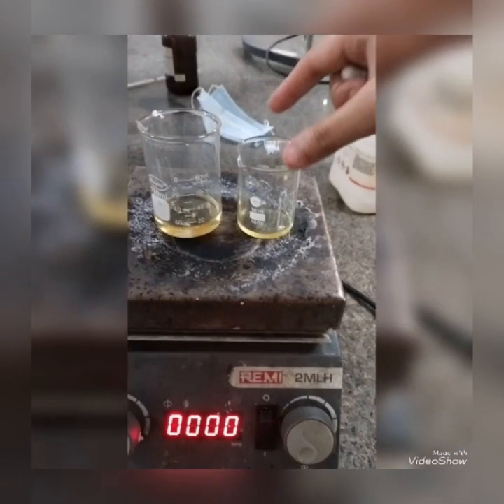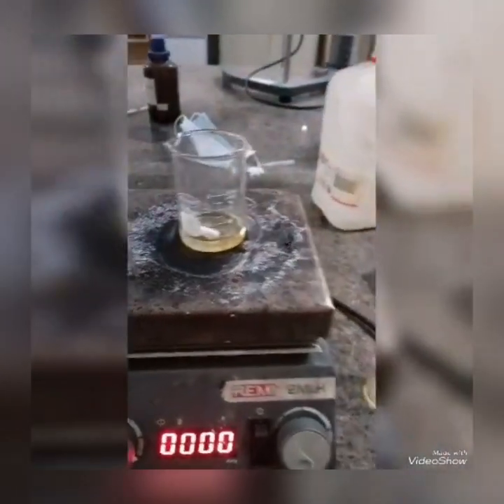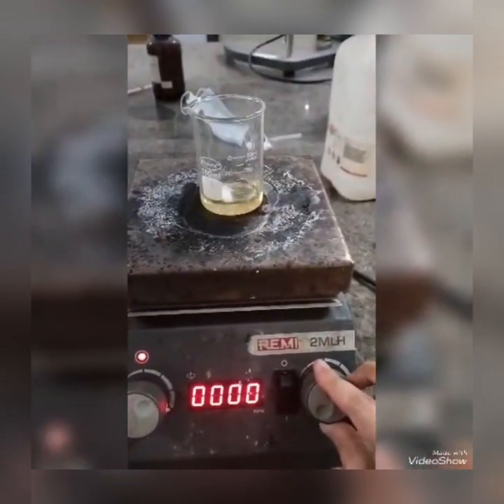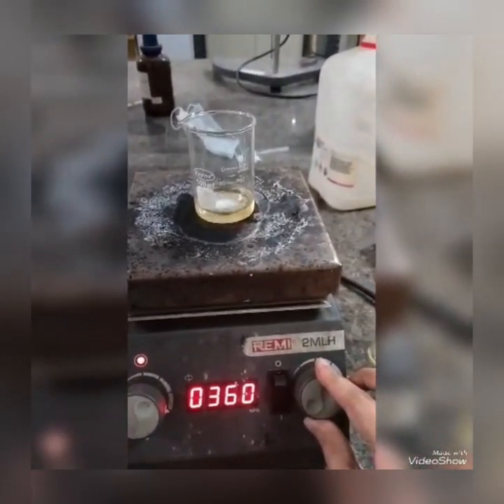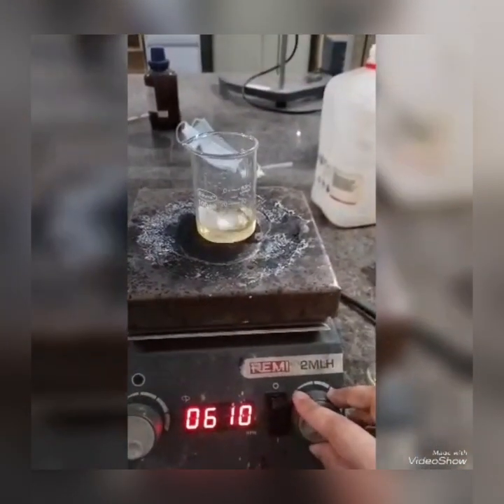After the temperature of the surfactant reaches 80 degrees Celsius, the aqueous phase was dispersed slowly into the molten oily phase and mixed on a magnetic stirrer at 1000 rpm for 1 hour.